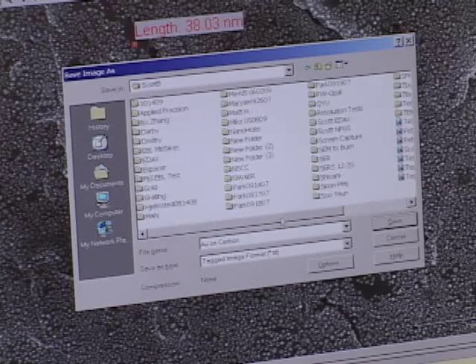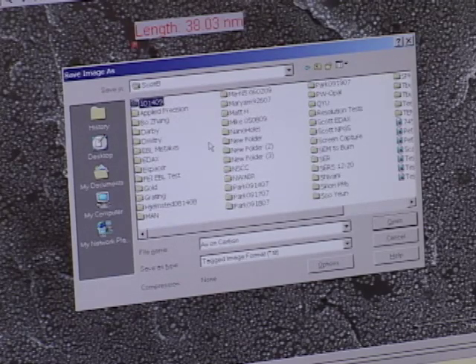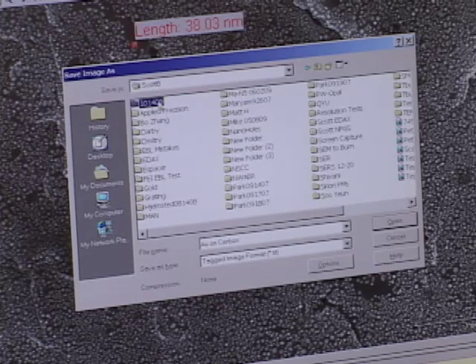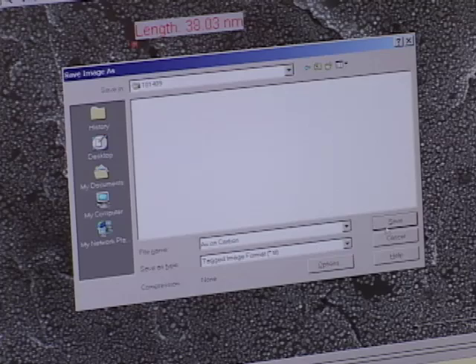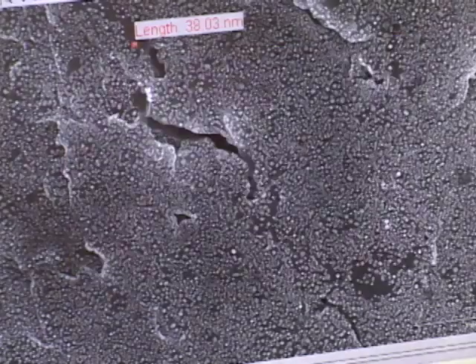You can see that 1014.09 is here in the left corner. Now that I have that open, I'm going to click save.